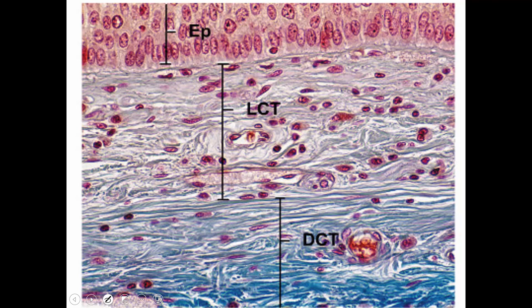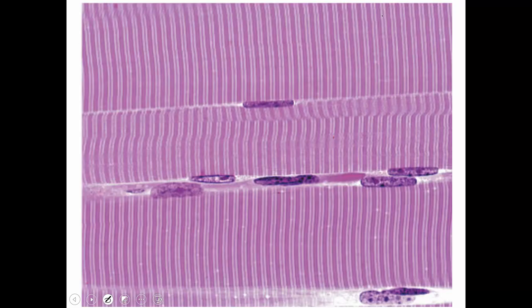That's histology. There you go. If the stain is staining the collagen fibers turquoise, which has more fibers present, the loose or the dense? The dense. You see that? That's histology. So dense connective tissue has a high fiber-to-cell ratio, and loose connective tissue has a high cell-to-fiber ratio. It becomes obvious. You can move on. Dr. Newman will talk about that even further when he does connective tissue. But that's histology. Here, this is muscle, striated muscle. And you can appreciate in this particular striated muscle that this plasma membrane probably goes like this. The nuclei, central or peripheral.